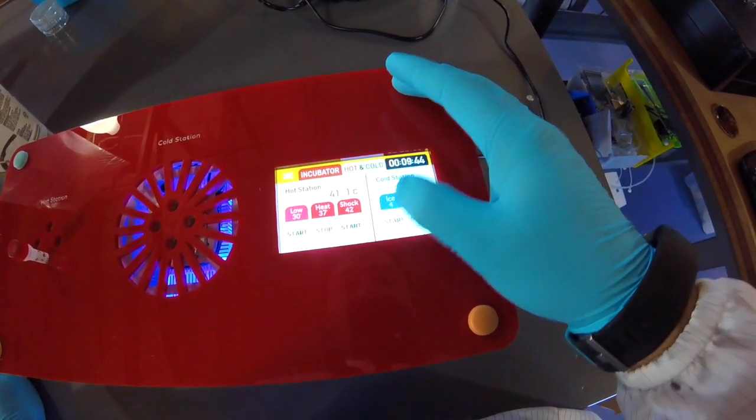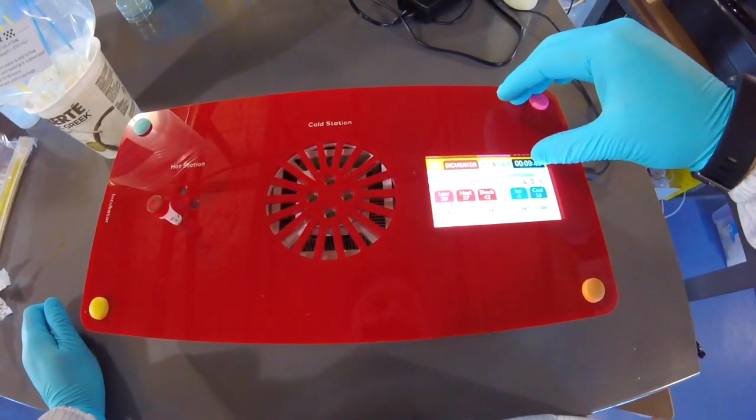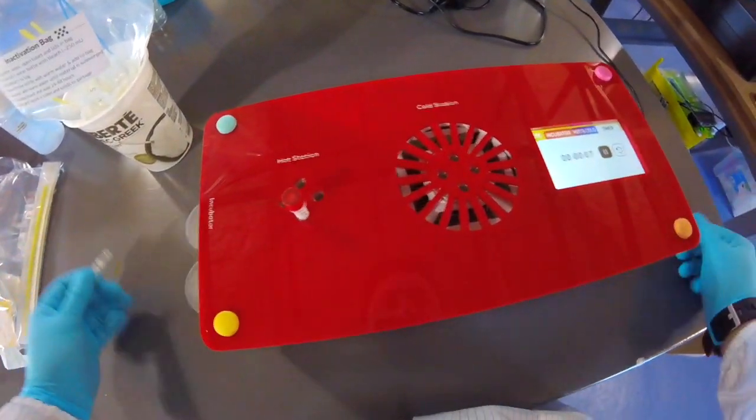I'm going to turn off the cold station. All right, we don't need that anymore. And I'm going to go ahead and reset my timer so that it's now from the point where we finished the recovery step.